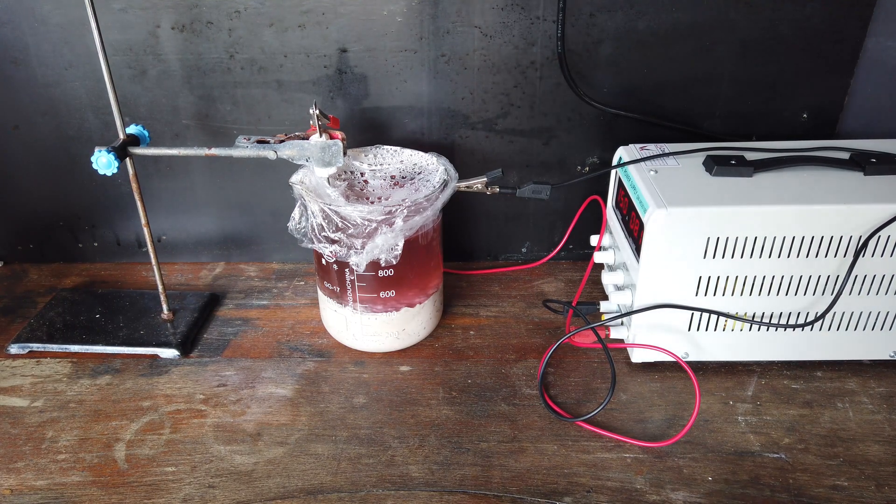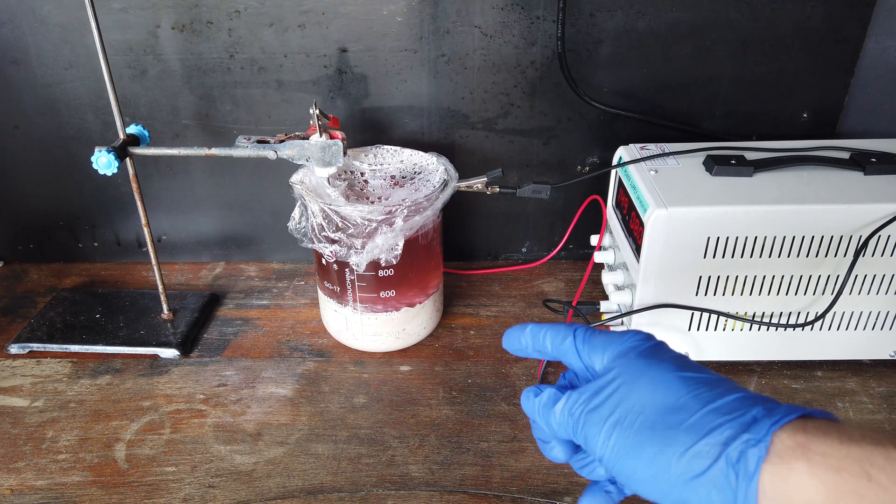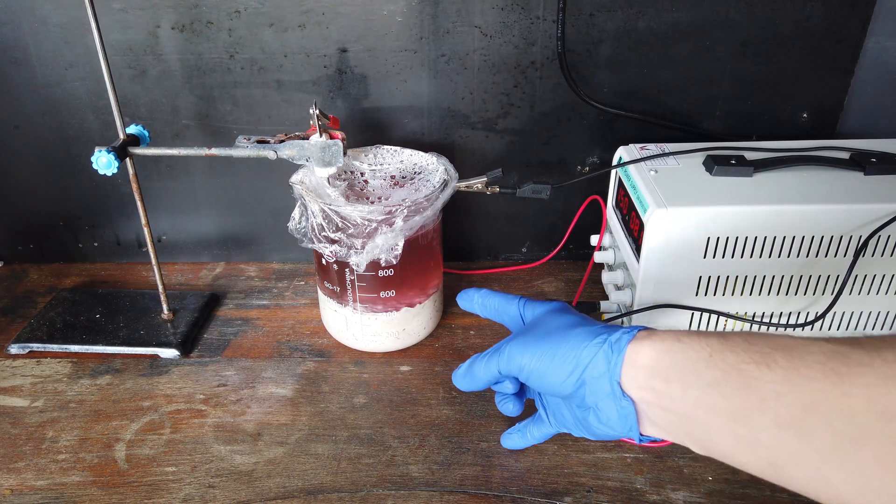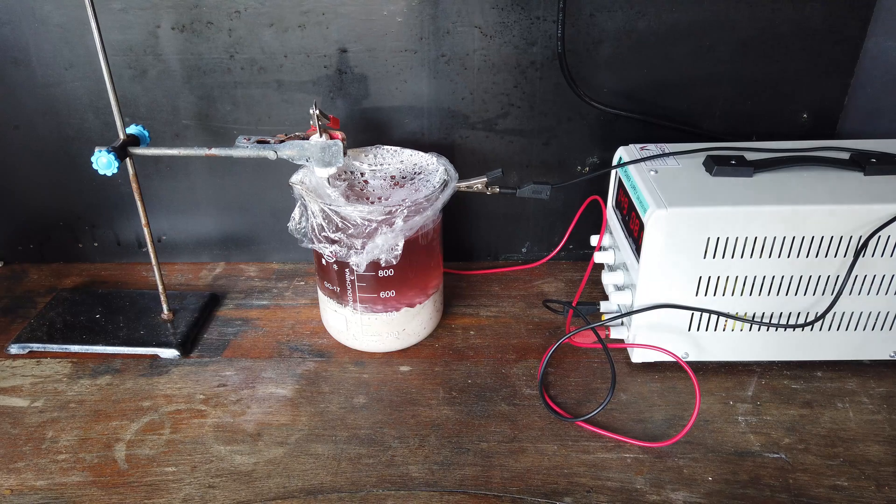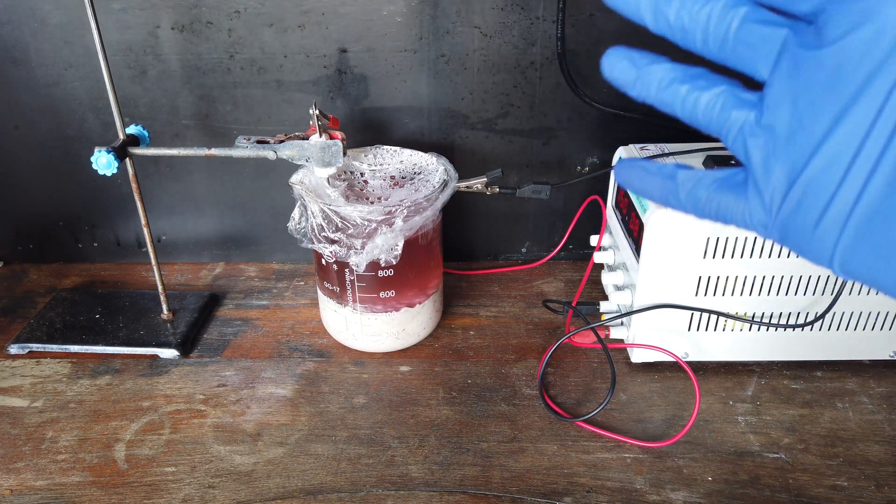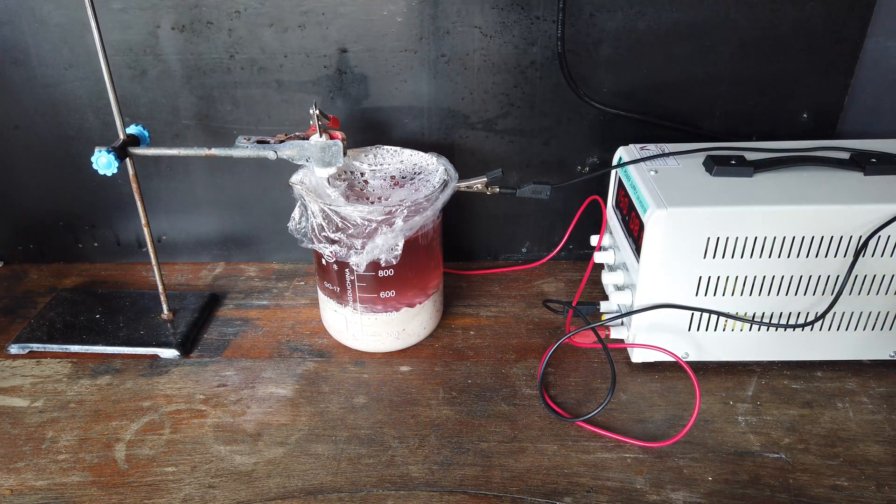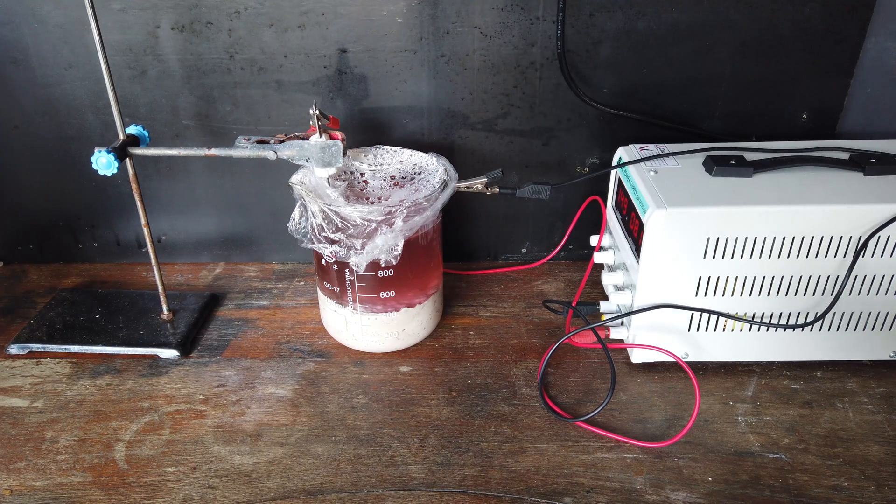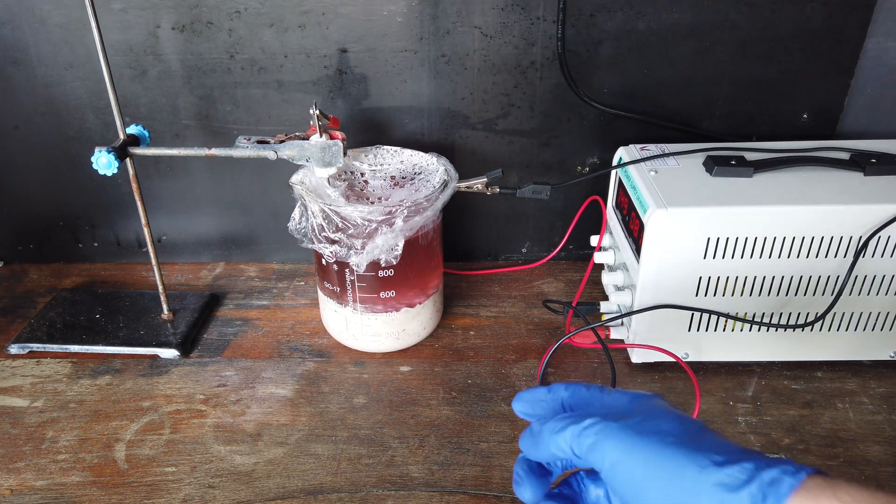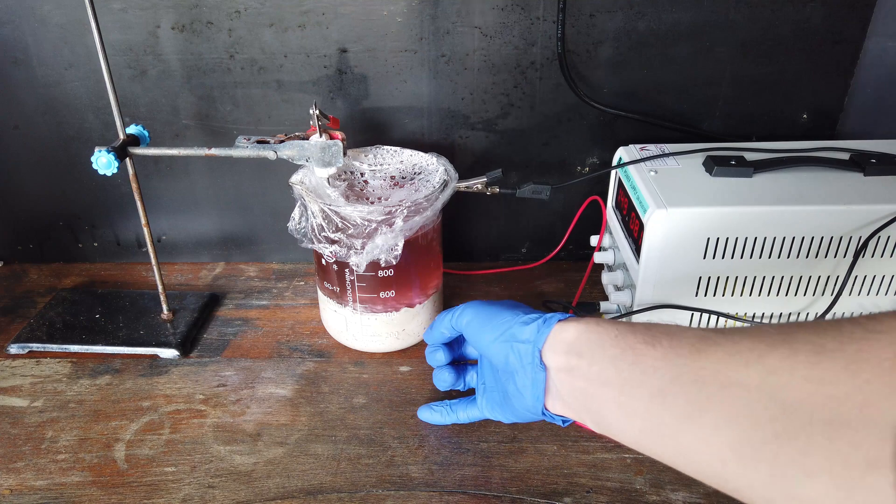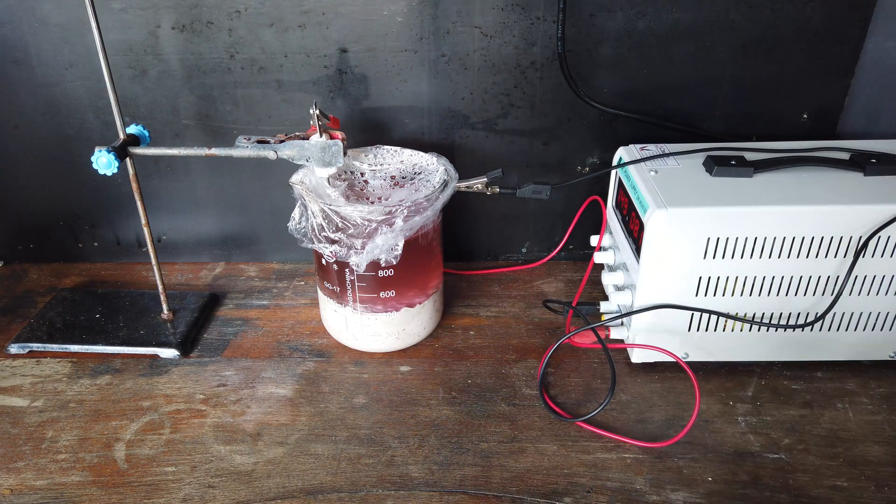From observing what happens, you can probably actually notice there the color of the solution in the beaker has gotten considerably lighter than when we started. So, we have successfully removed transition metals from solution and that has been happening faster than the transition metals have been dissolving in from the hydroxide precipitate.